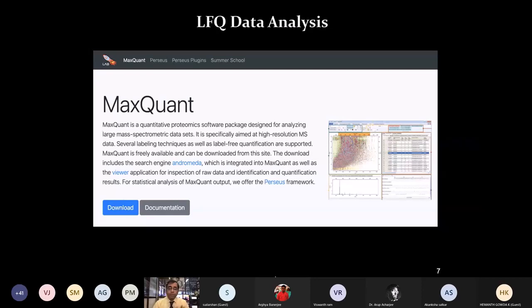And so the number 35 that was given has to be played with, between 29 to 35, to see what works best for your kind of labels and fragmentation. Also, sometimes stepped works better, especially for the label-based methods. So these things have to be played with, and as we go along we will try to show you more software features. And of course, it will also depend on which instrument and which configuration you are using.